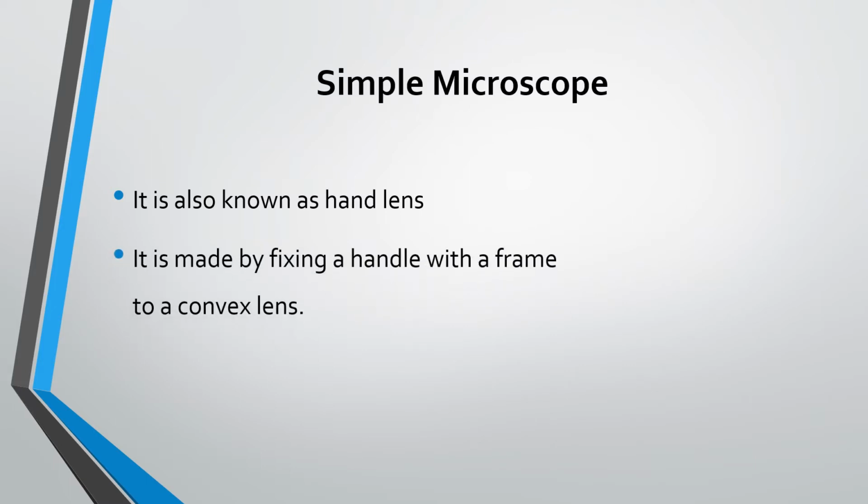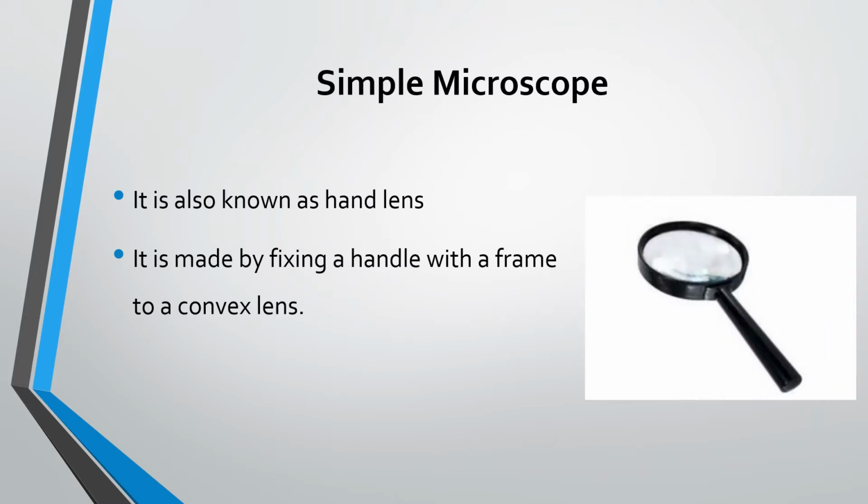And it is made by fixing a handle with the frame to a convex lens. Convex lens.